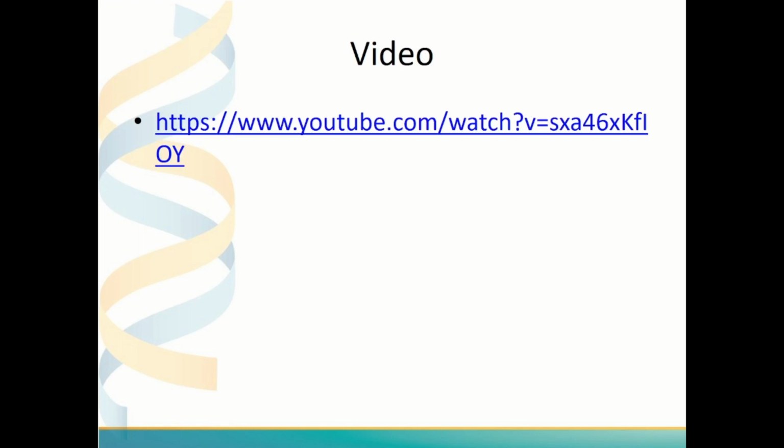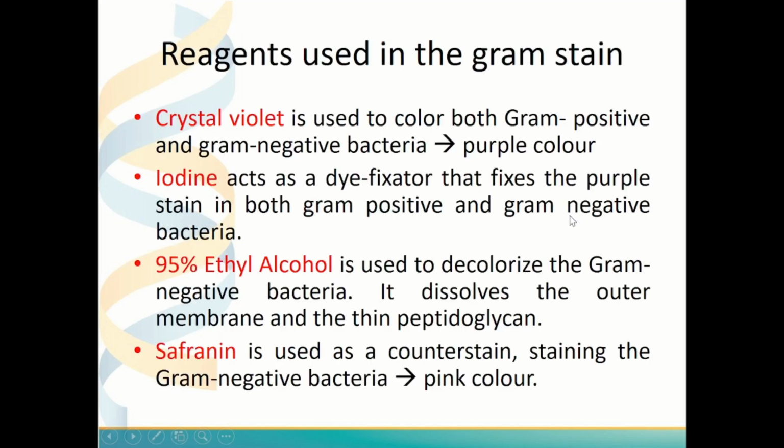For better understanding of the gram stain technique, I have also prepared a link that you can access from your own PC. After watching the video, you will find out some reagents were used in the gram stain technique. And these are the reagents used in the gram stain technique.